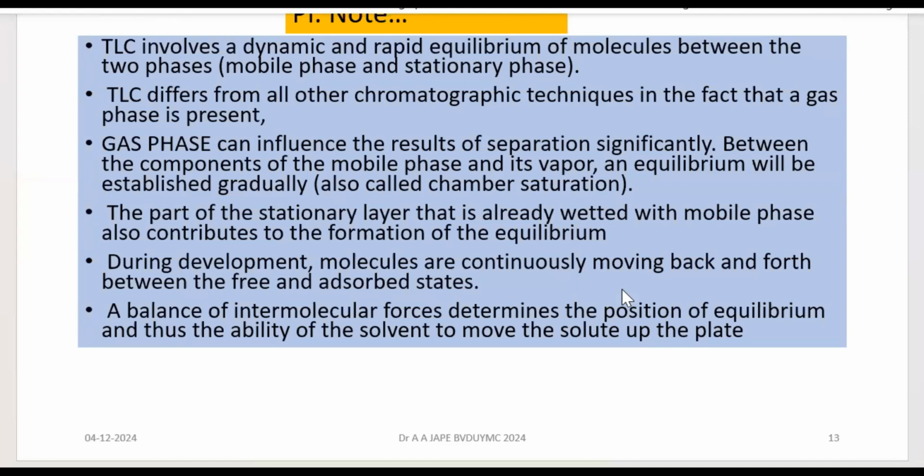It will be working in tune with the stationary phase, as partitioning between stationary and mobile phase is the very crucial step, and preparation of a mobile phase with a minimum number of components with good separation is expected.